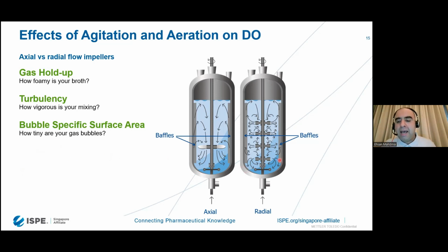So in that fashion, the impellers inside the stirred tank bioreactors act in two forms of homogeneity. First is axial movement, which is essentially keeping the bubbles down and the mixture going in a spiral vertically for homogeneity, and then radial dispersion, when you make sure that the liquid is dispersed equally and homogeneously throughout the diameter of the stirred tank bioreactor.